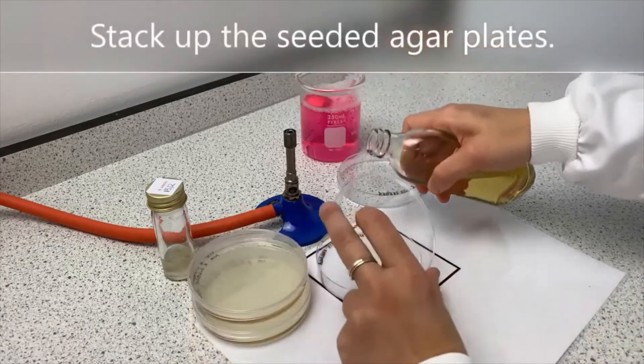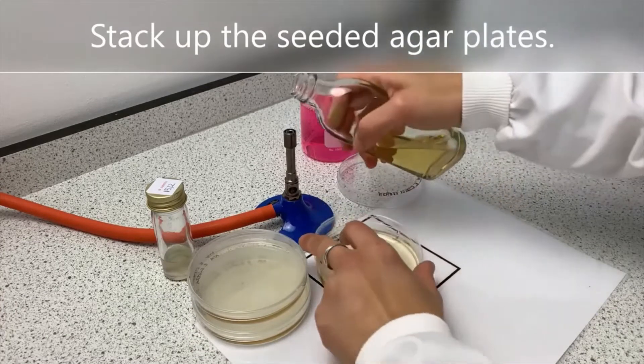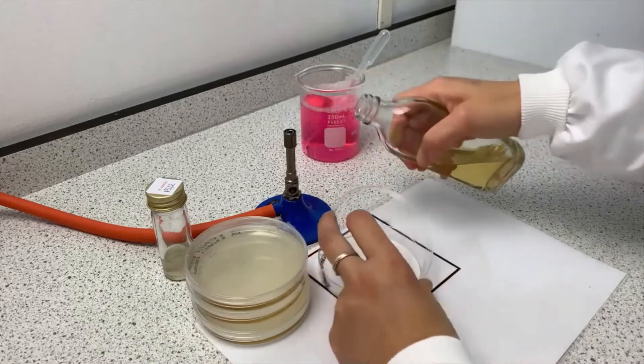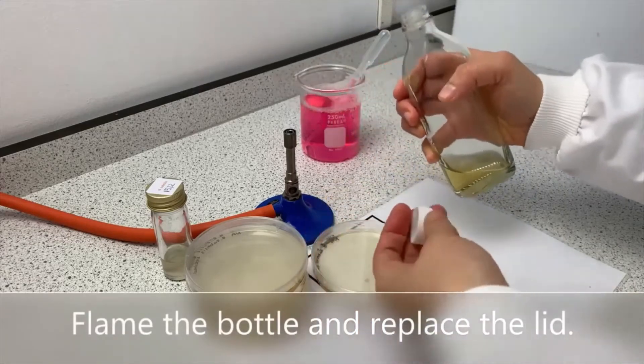Stack up the seeded agar plates. Flame the bottle and replace the lid.